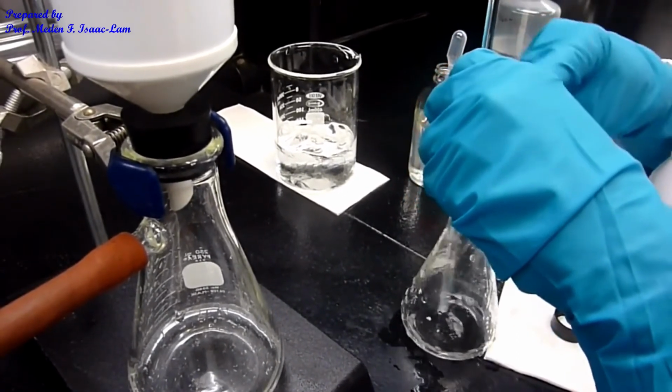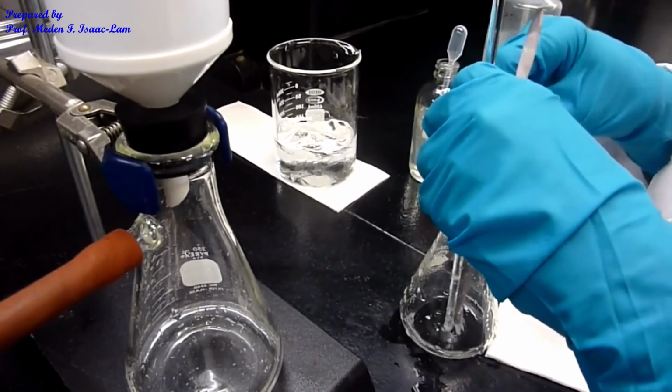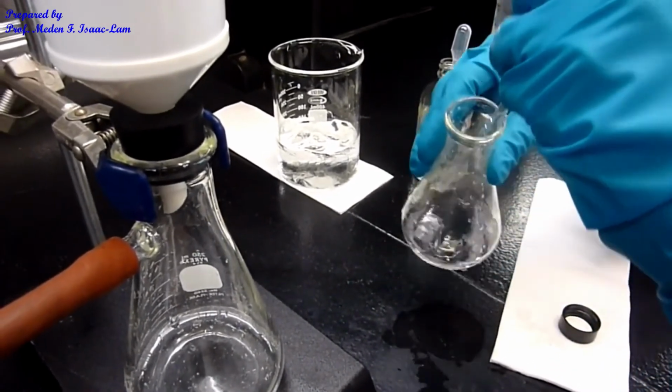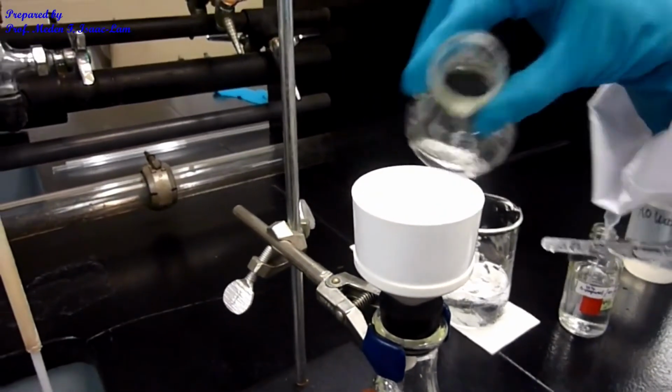So that kind of cleans out a little bit of the unreacted acetic anhydride. So I'm gonna rinse out.